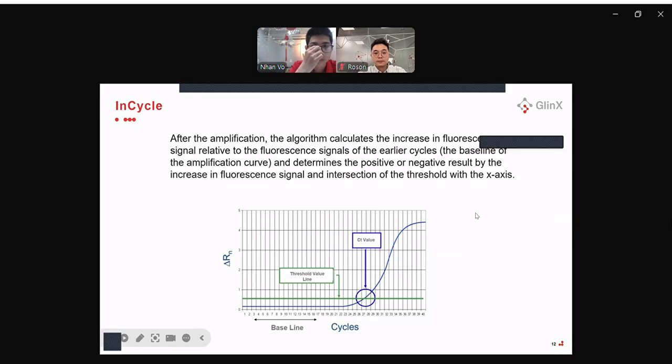If it is a positive result, that represents the target pathogen has been successfully detected, and the shape of the curve will look like an exponential curve. If there is no target gene within the sample, that represents the animal is not infected, and the amplification curve will become a straight line with no change in the fluorescent signal. The negative result shows a straight line.